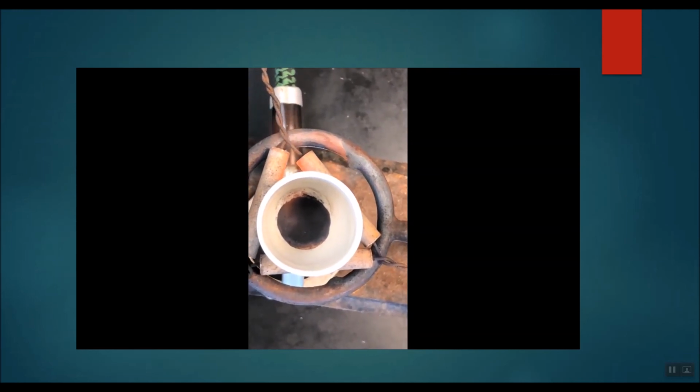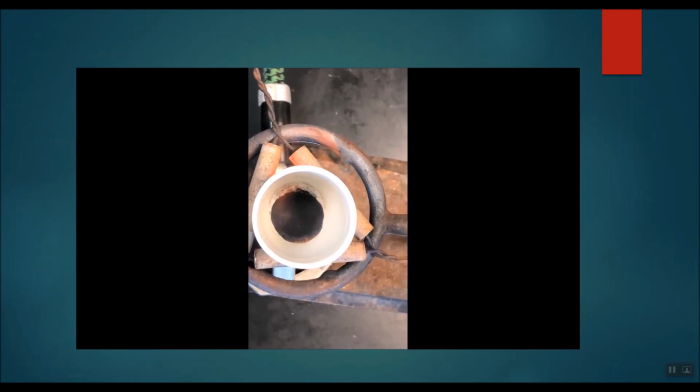What you're seeing there is copper oxide. If you look at around 11 o'clock, it is glowing red. It is so hot.